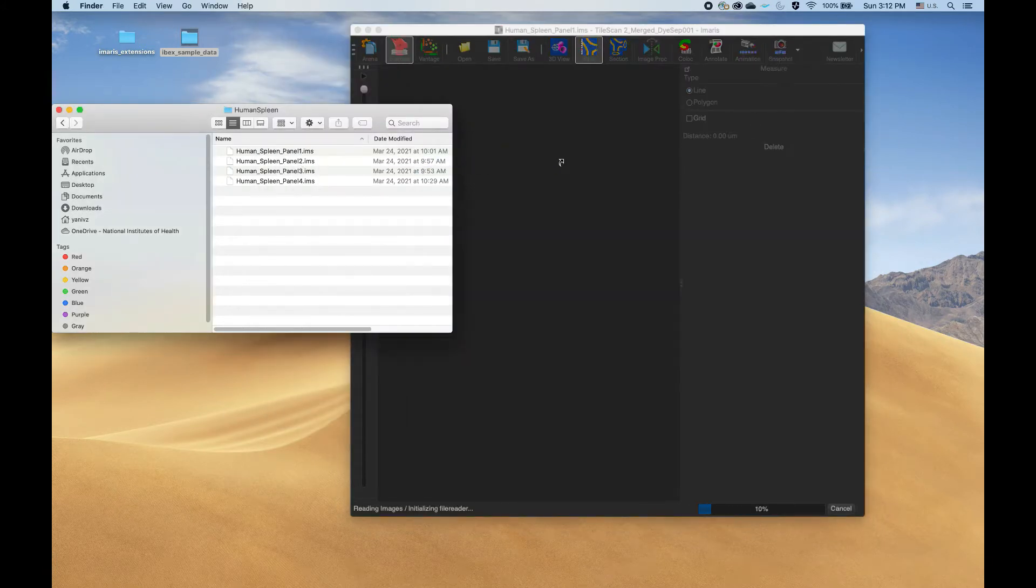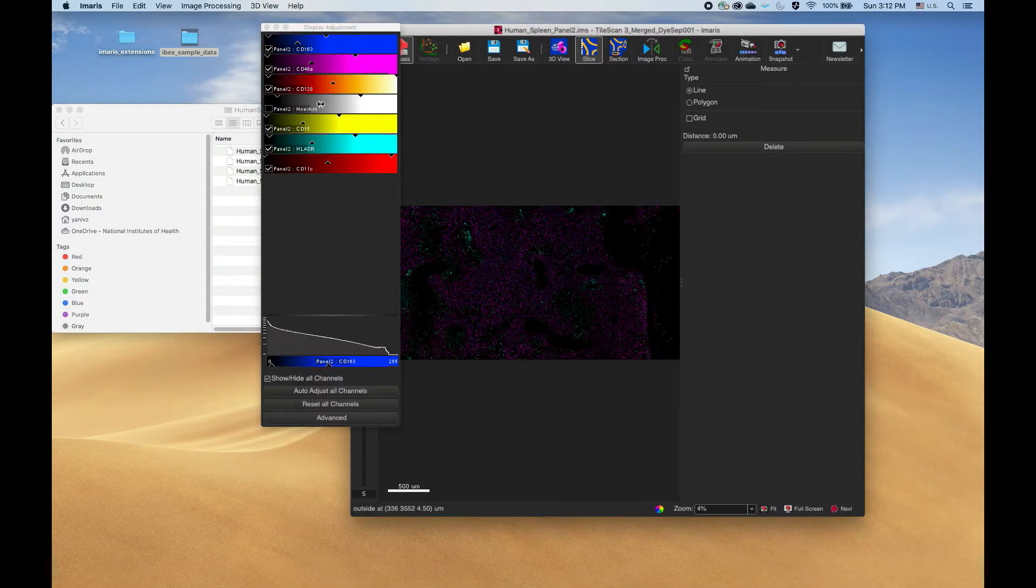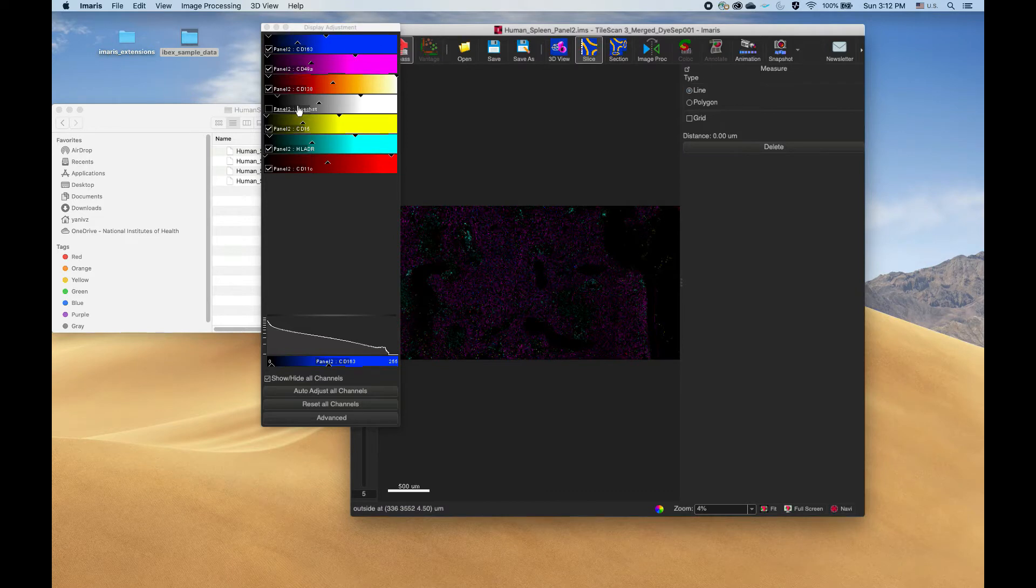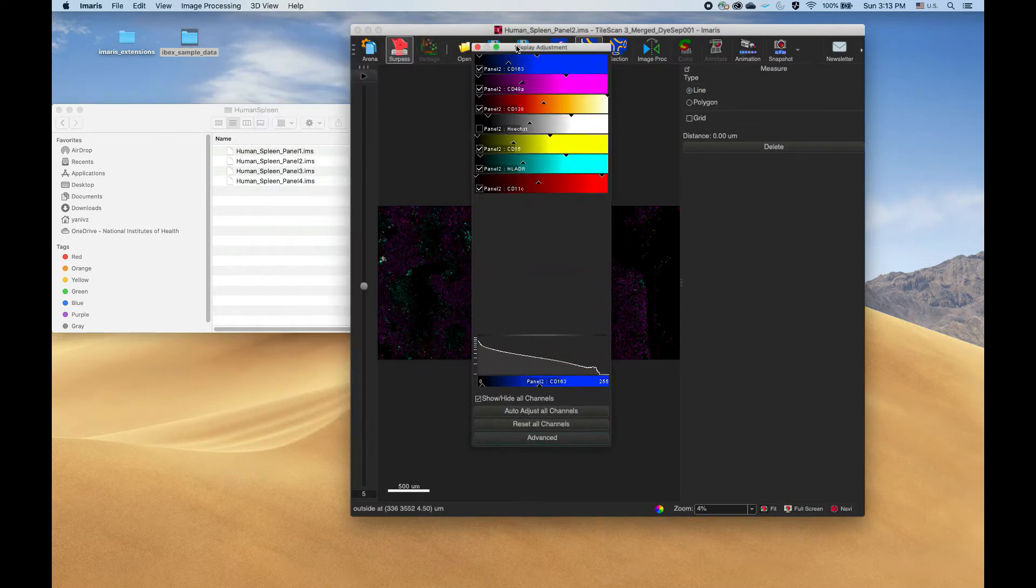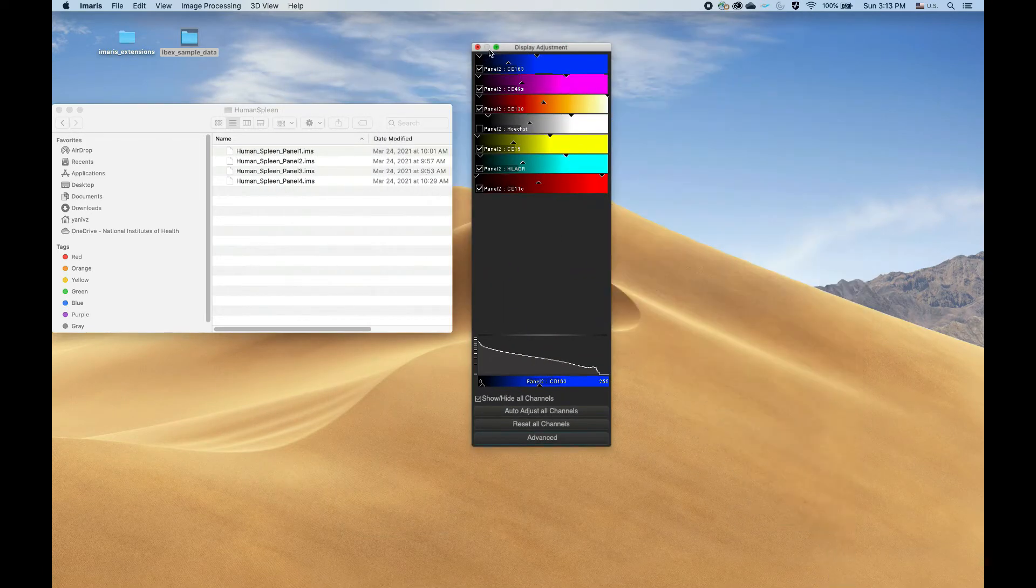If we open panel two, we can see that yes, everything is called panel two colon something, so the channel name in this case Hoechst, and these are the files we'll be working with. So without further ado, let's run the extension.